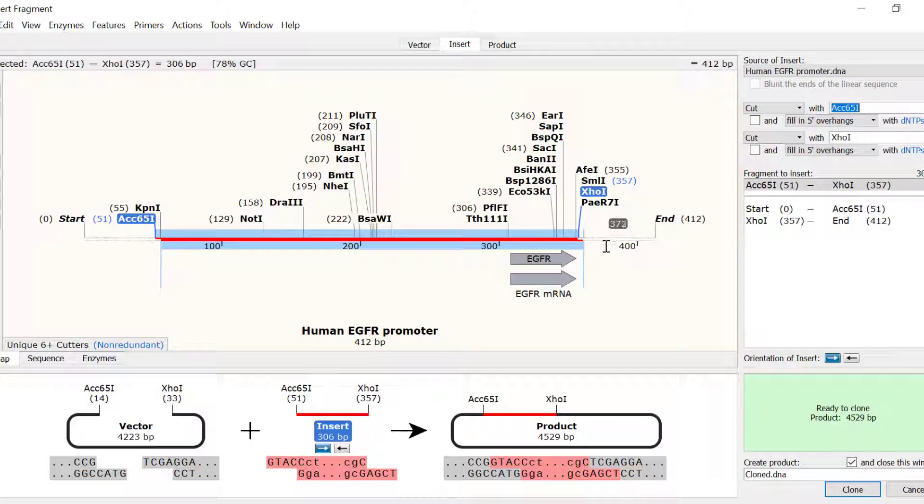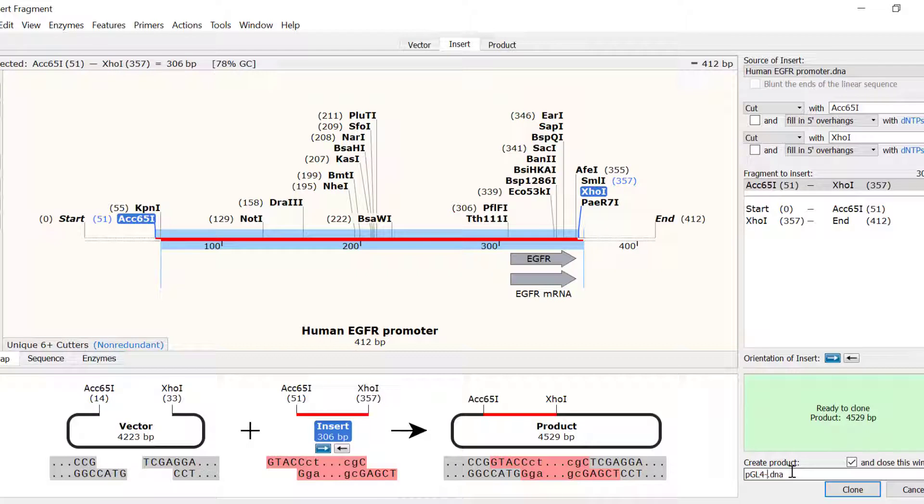Finally, we need to give the file a name. I will call mine pgl4-egfr promoter, and then we can click the clone button to simulate the cloning.